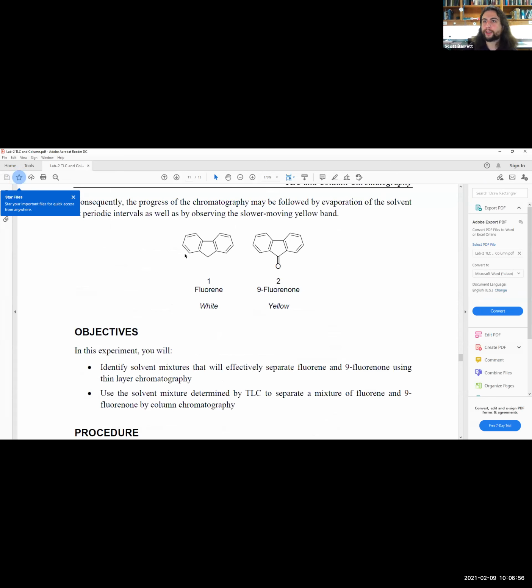It just has more polar characteristics than the fluorene, which is just a ton of carbon chains, 2 aromatic groups, no oxygens, no hydrogen bonding. However, 9-fluorenone, like I said, has the oxygen here, so it would exhibit hydrogen bonding, whereas the fluorene would not. So yes, 9-fluorenone is more polar, fluorene is more nonpolar. So finally, let me go ahead and open up this polarity index for you guys, and then we can wrap it up.